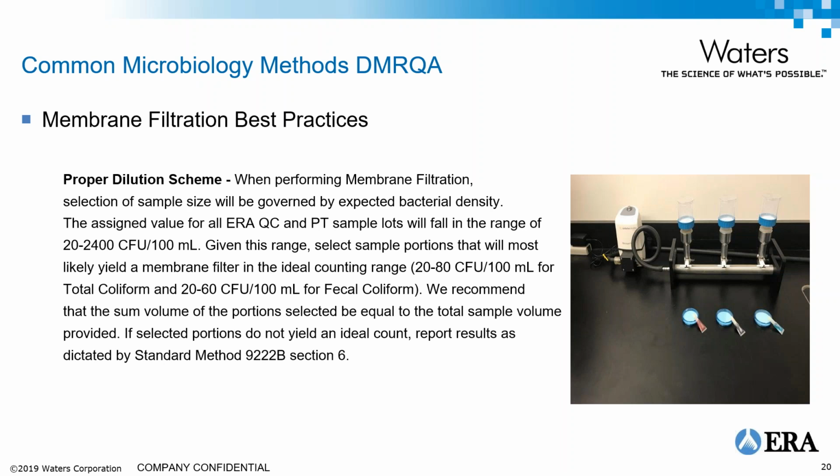We also recommend that you run the entire volume of the sample. Don't just run 50 mils of it. You actually want to run dilution portions so you can consume the entire volume.